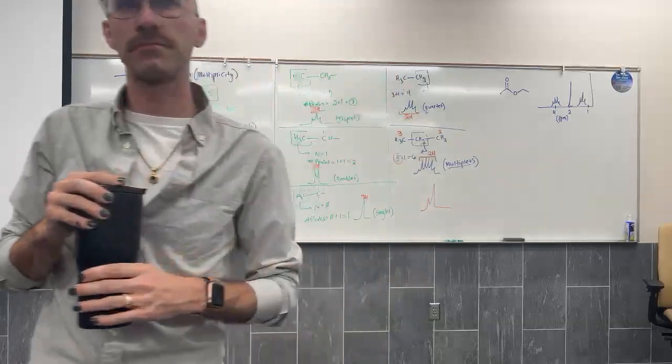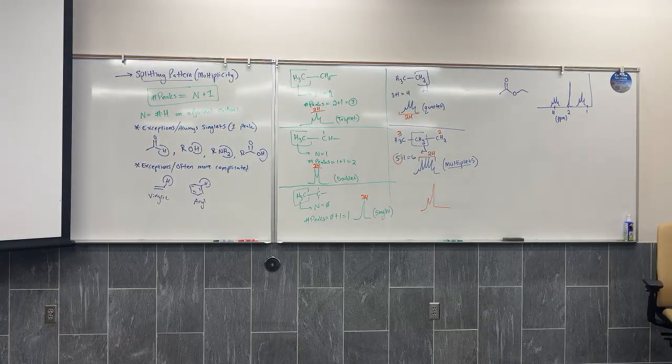I think the one furthest to the right, you can join this group. You're close enough. Methyl group furthest to the right. Okay. We're going to assign integration values to those signals based on what we understand.